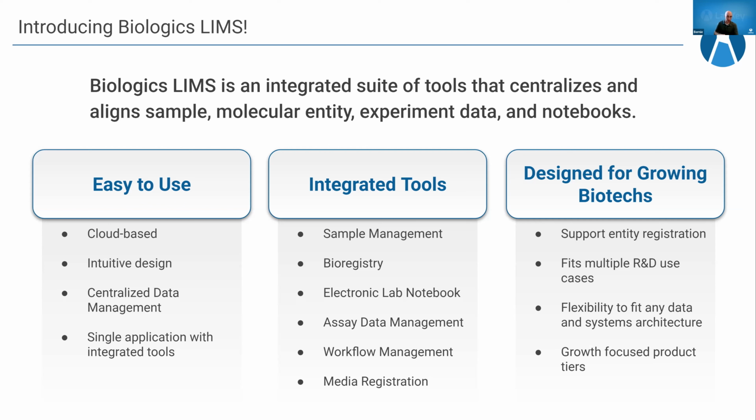Now, we're all forced to learn spreadsheets at some point, which are, of course, very powerful. And picking up alternative tools must be at least as easy to use, which is why we at LabKey, of course, have an entire team of user experience designers and ex-scientists to help guide our products. Those new tools also need to serve a clear purpose. They need to ameliorate common pain points in the industry.